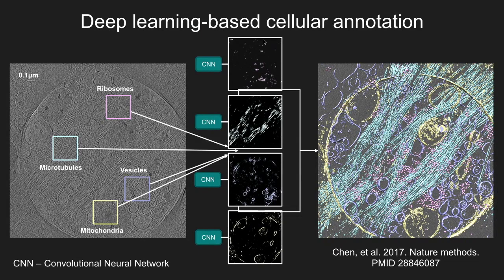The key is that training each of these networks only takes an annotator about 15 to 30 minutes. And once you've done it, you can apply it to an unlimited number of cells. So if you need to train up 10 or 15 of these networks, it's something you can do in a morning. And once you've done it, you can then annotate 50 or 100 different cells. You don't need to spend 50 to 100 weeks annotating all the cells by hand. So this works pretty well.